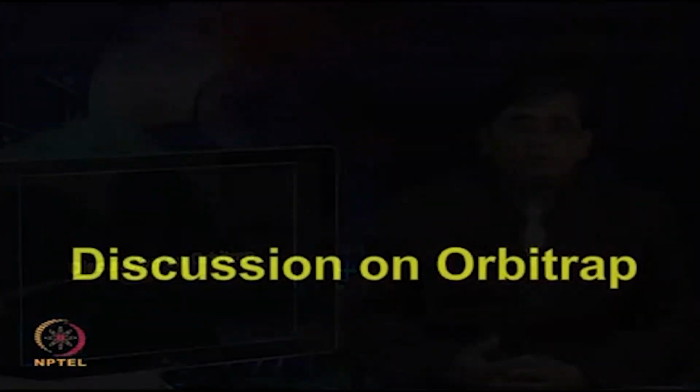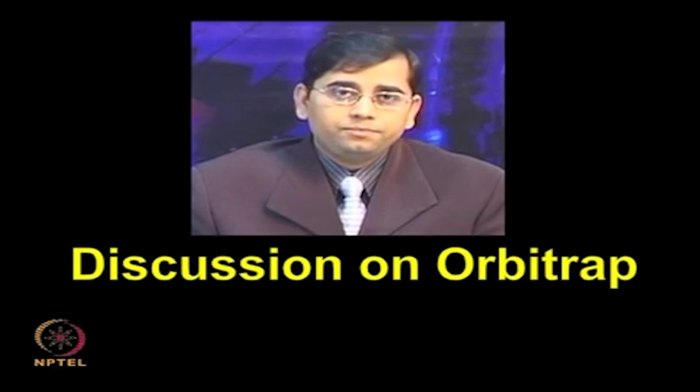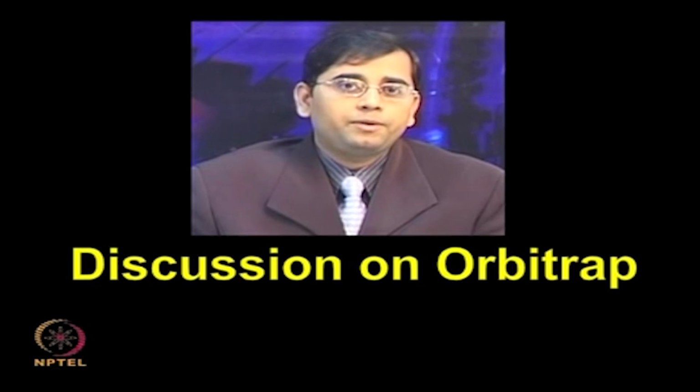So after the discussion on the quadrupole time of flight, the QTOF, as well as triple quadrupoles, now let's move on to another latest configuration, the Orbitrap, which has very much similarity with the ion trap, but is one of the very latest additions to the proteomics workflow, where people are applying this for various types of biomarker discovery and different other applications.